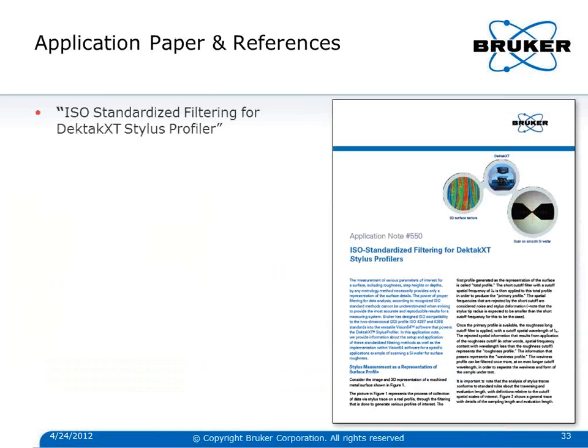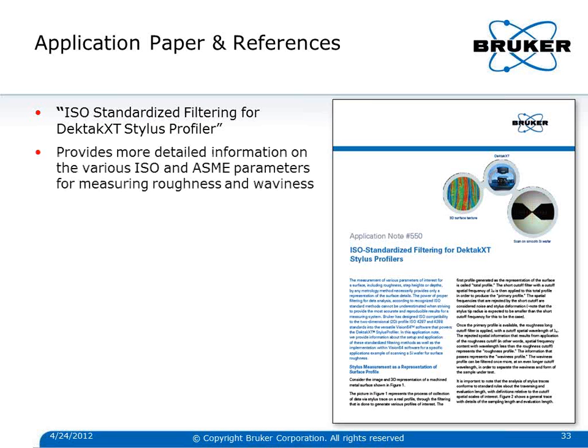So finally, I just wanted to point out that there is a very nice application note on the Bruker website. It's titled ISO Standardized Filtering for Dektak XT Stylus Profiler. So this presentation that I gave today was based on the information in this application note. So please go to the Bruker website and get that information if you would like to find out more about what was discussed in the presentation today.